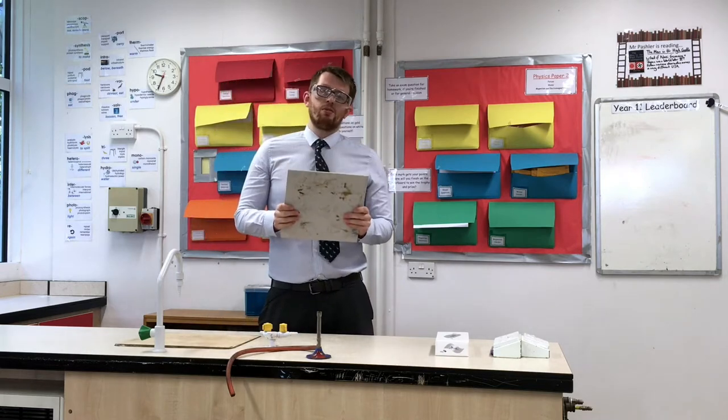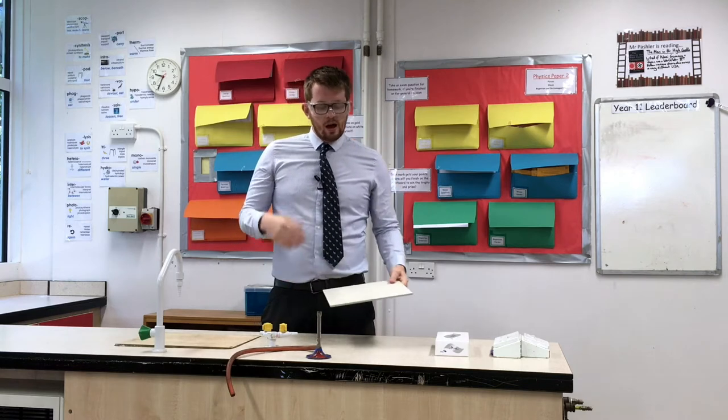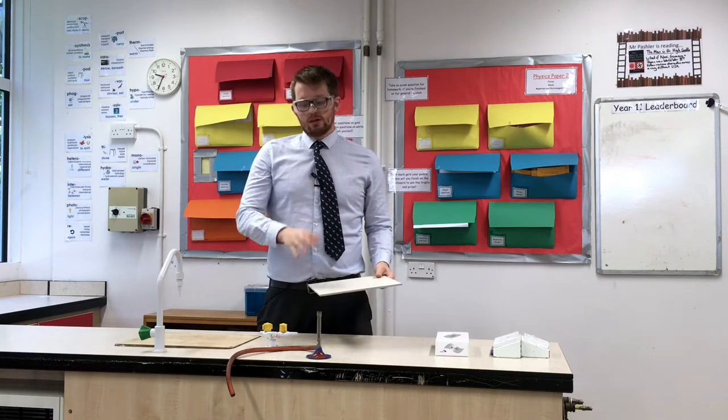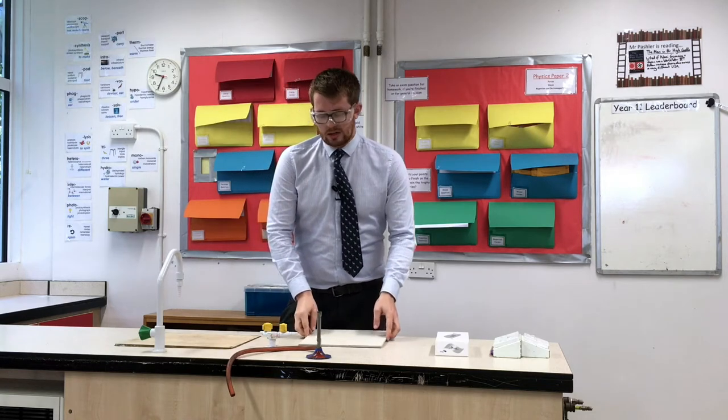We also set it up on a heatproof mat. This provides that extra protection, and if we're heating anything on the Bunsen burner we can put it down there and feel safe that we're not going to cause any damage.